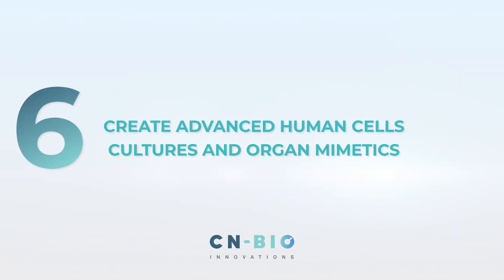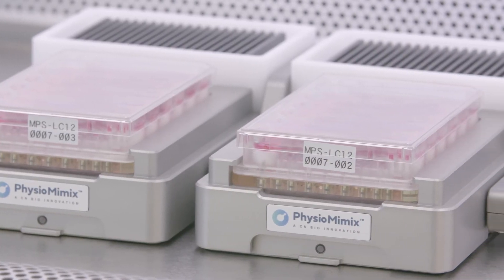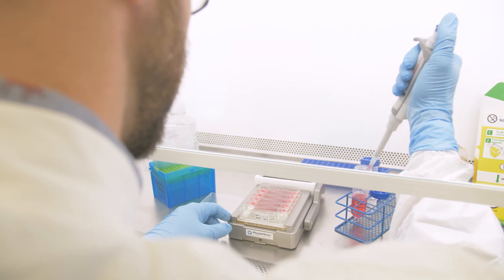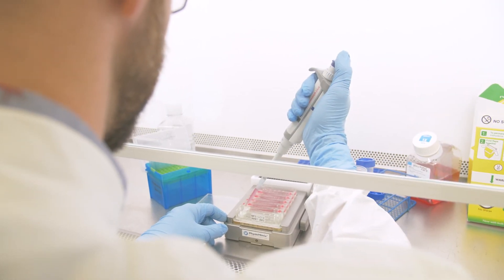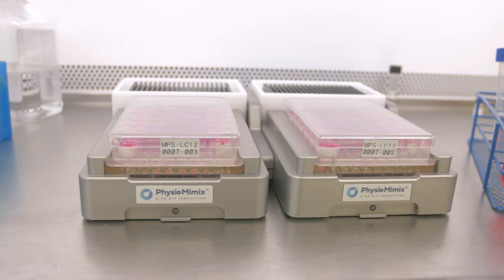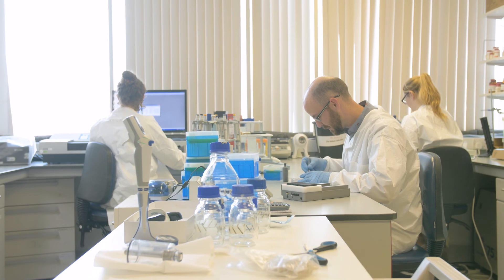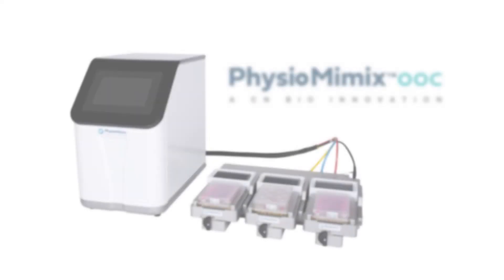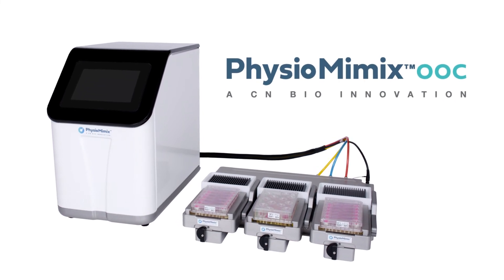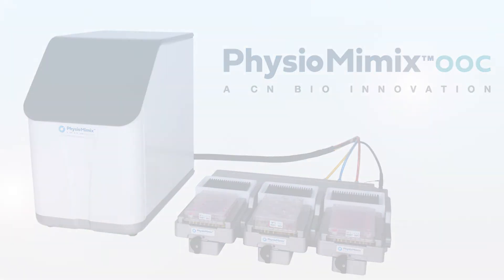Step 6: Create Advanced Human Cell Cultures and Organ Mimetics. PMXOOC is a streamlined, low-footprint lab instrument compatible with a variety of PMXOOC MPS plates to enable the study of various human tissues and disease processes. PMXOOC quickly increases your in-lab capabilities to more accurately recreate human-relevant cell culture models. Whether you want to maximise the potential of your existing cultures or undertake complex multi-organ studies, Physiomimix OOC is the cutting-edge cell culture solution for your research.